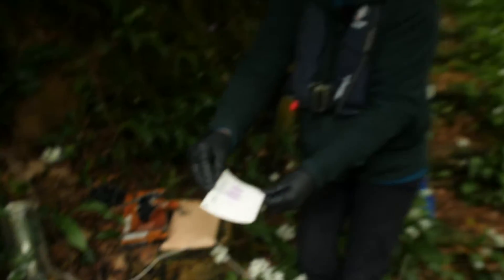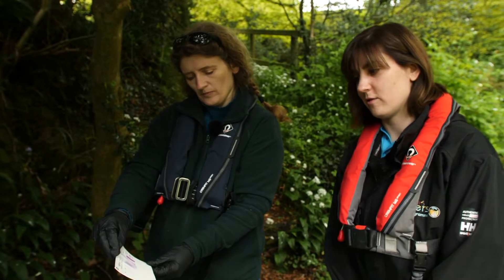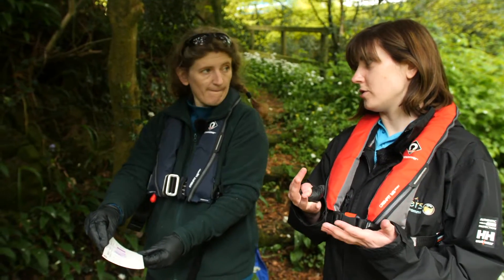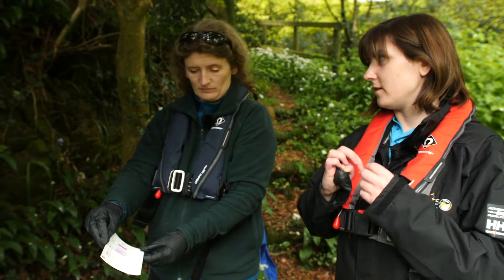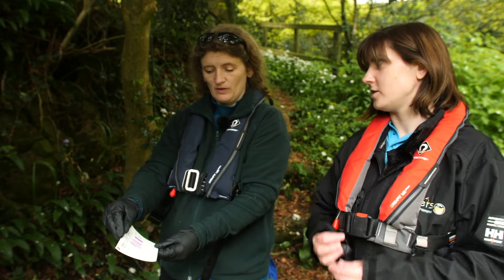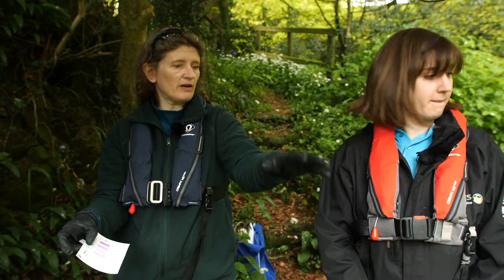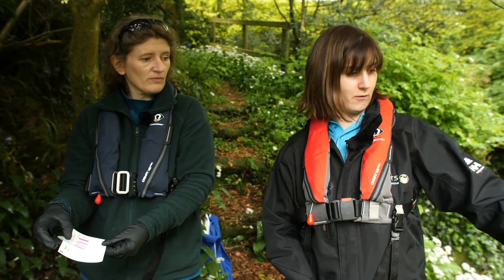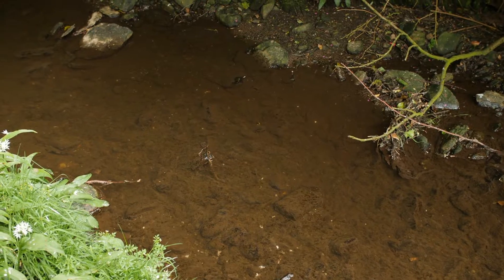You can see there's a good bit of pink there, so you're looking at excess phosphate in the river, which along with the nitrite will feed your primary producers like algae. You get too much of them — they're overfed, they become excessive, and they start to use up too much of the oxygen in the system. It's even taken over the habitat where the little invertebrates that fish feed on would like to live.